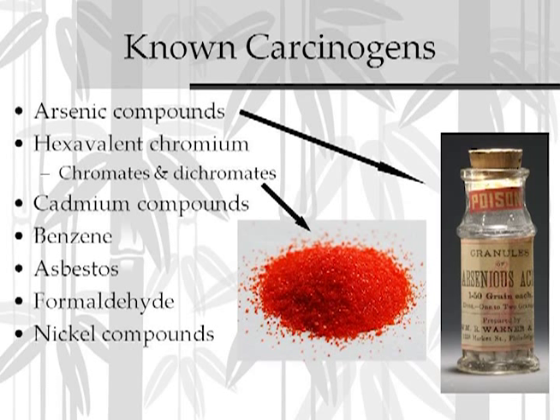In a high-level teaching environment, advanced placement chemistry, something along those lines, college-level chemistry, the dichromates, in particular potassium dichromate, do have a place in that venue. We recommend that they only be purchased in a solution, pre-diluted, and that way you don't need to run the risk of people breathing in heavy metal fumes and heavy metal dust from these compounds. They're also much less reactive.